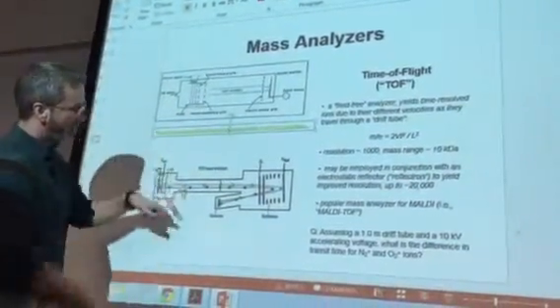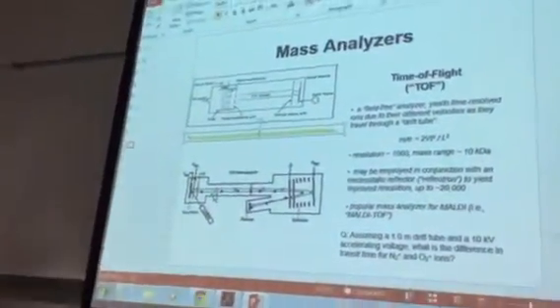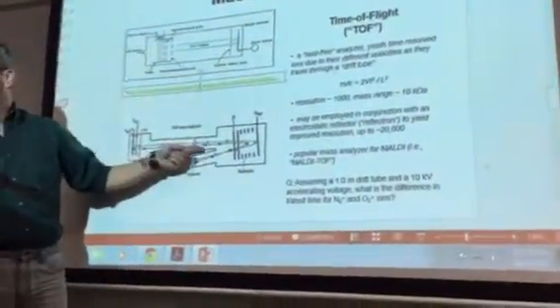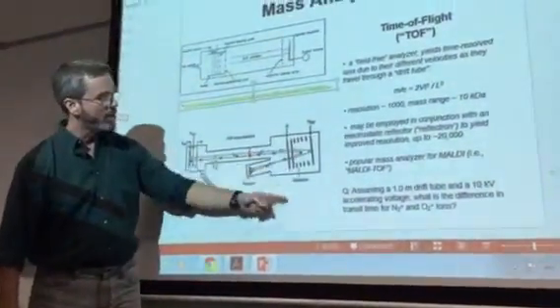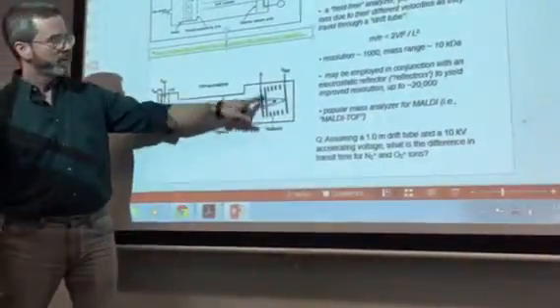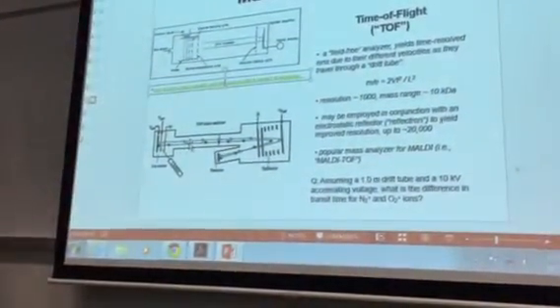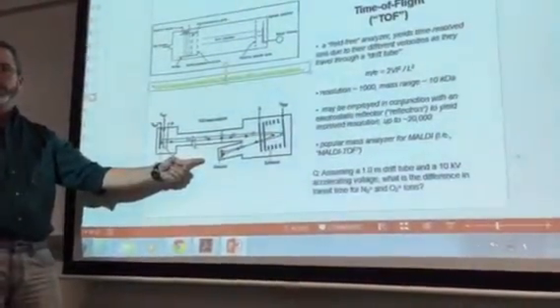Ions are generated. They're sent into this time-of-flight mass analyzer. There's, again, the field-free region, the drift tube, as it's called. But the path is just not a straight shot to the detector. The ions travel through this drift region, the field-free tube, and then they encounter the electronic analog of a mirror, right? The reflectron, as most people call it. It's an electrostatic mirror, basically, where the ions are redirected towards the detector. This does a couple things, actually.